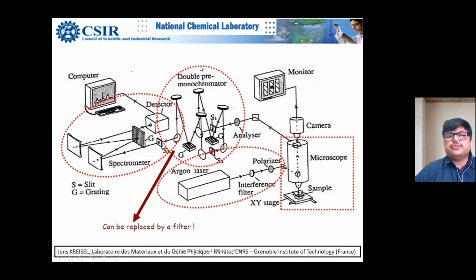So you are dispersing. There are two kinds of double monochromators: one is additive and another is subtractive. This one is subtractive. Basically, you disperse the light, and then you can physically block the Rayleigh once you disperse, and then you merge the light again, because the Rayleigh is already removed. The second grating is used for this part of the system. Then light enters the final spectrometer. So essentially this is not a triple monochromator; it is a single monochromator plus a double monochromator. That's why it is triple, 2 plus 1.